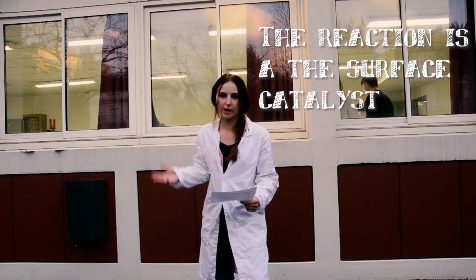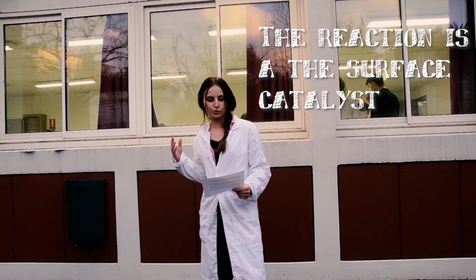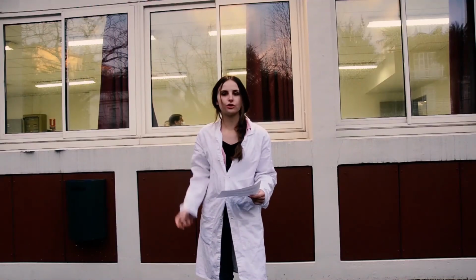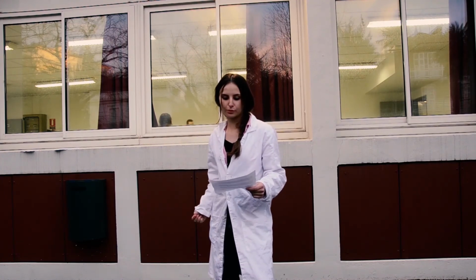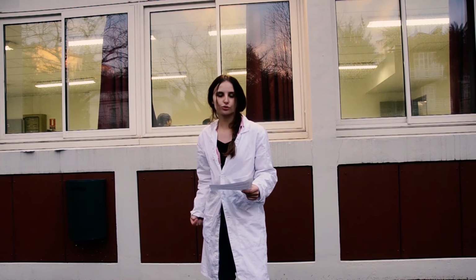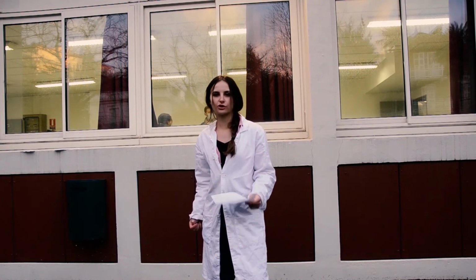We can say that the reaction is accelerated by the presence of the catalyst. This time the ions are homogeneous catalysts, here there is a gas release and a change in the color of the solution. The color change of the solution indicates the Fe3+ ions participate in the reaction and are regenerated at the end of the reaction because they return to the original color of the reaction.